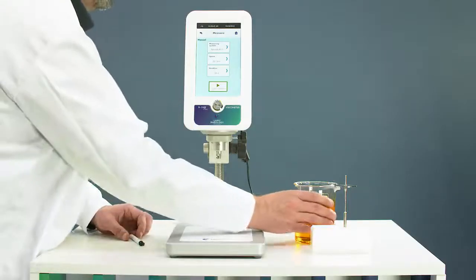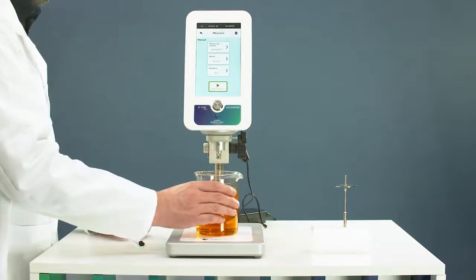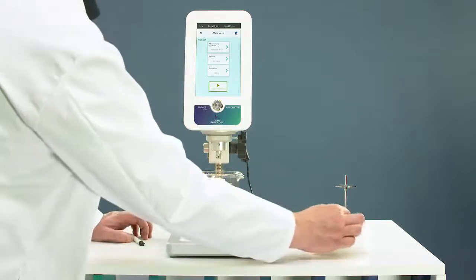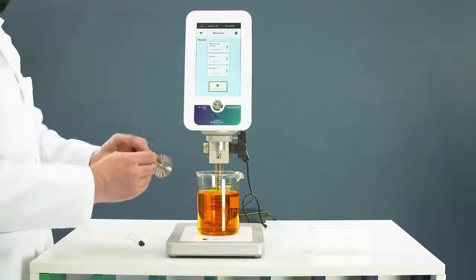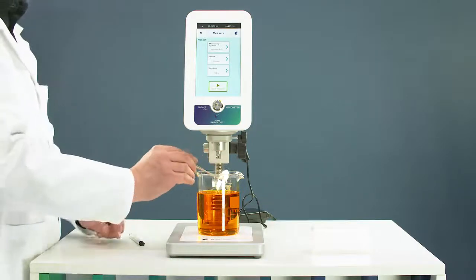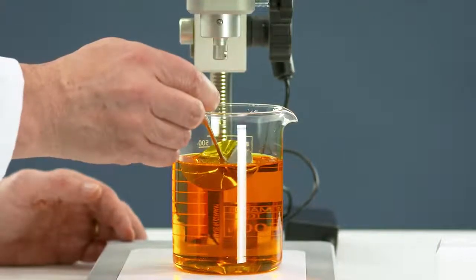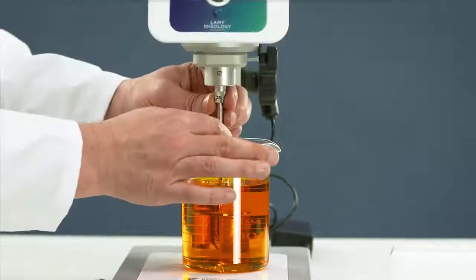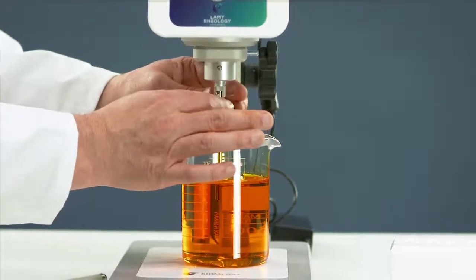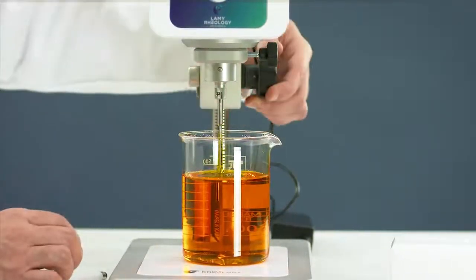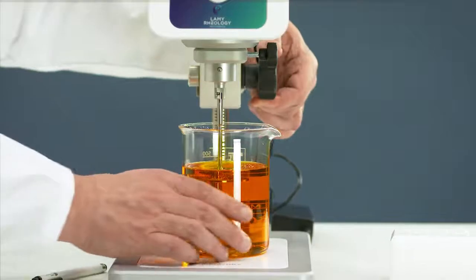Take the beaker with the sample and place it below the device. Take the spindle and tilt it obliquely to avoid air bubbles. Connect the spindle using the easy bayonet coupling. Reach the perfect position by using the mark on the spindle's shaft.